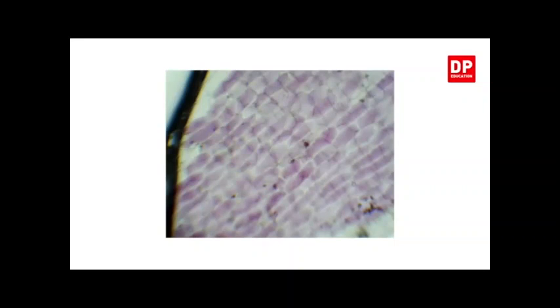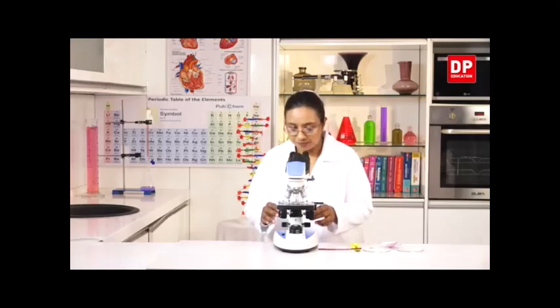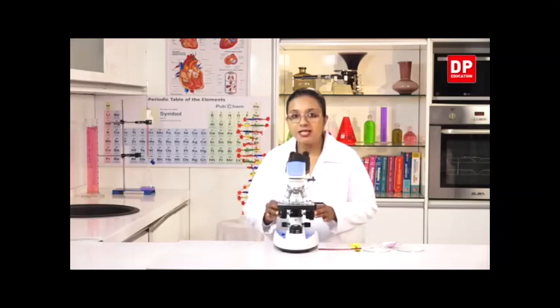Here the cells are different from the previous specimen. Here the cells look polygonal in shape. You all also can see it clearly. The cells are polygonal in shape. They do have sharp edges. Those are the cell walls. But this is not clear enough.